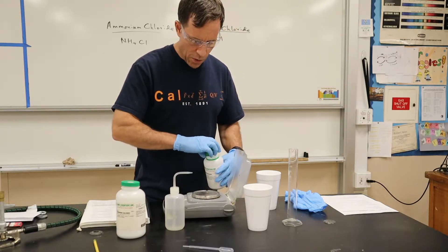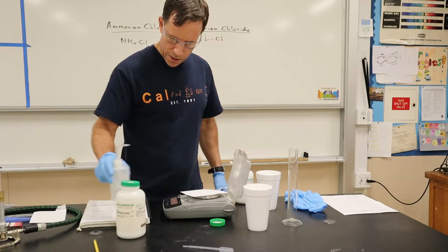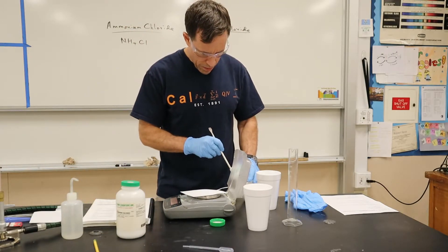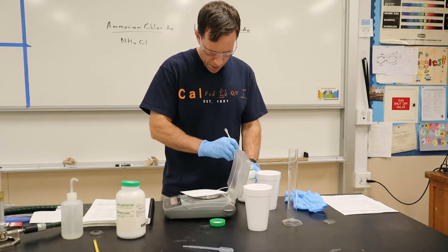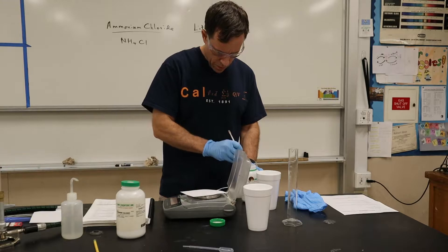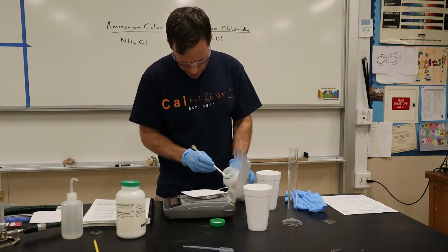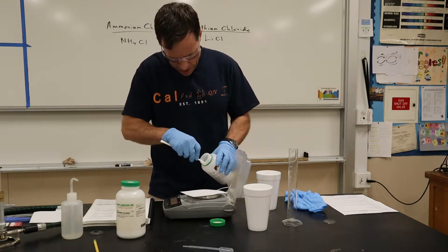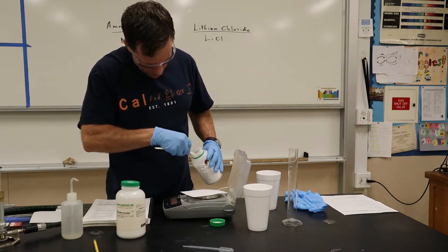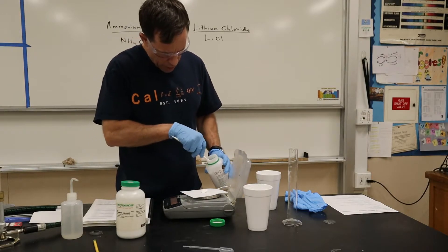The first one I'm going to do is lithium chloride. I'm going to measure out roughly about five grams. I'll zero it, then get my spatula and measure out roughly about five. It has a lot of chunks in here — it's very chunky. Okay, that's about 2.5 grams so far.